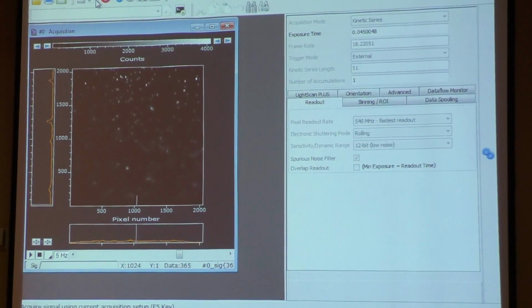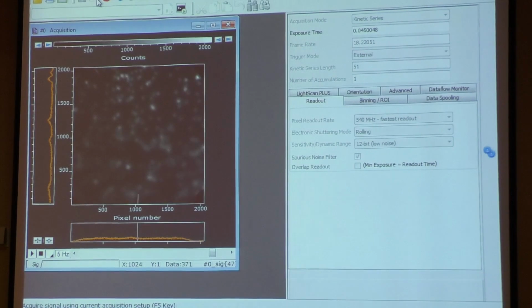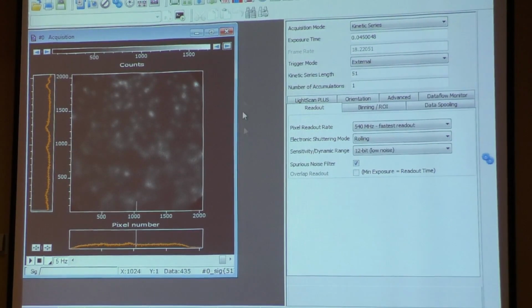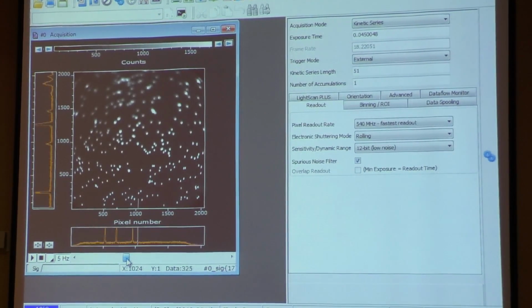That's part one of our deliverable. And it is basically a program that is around. It's an ImageJ plugin, where what you do is you take a step like this. Yeah. You see this curvature?